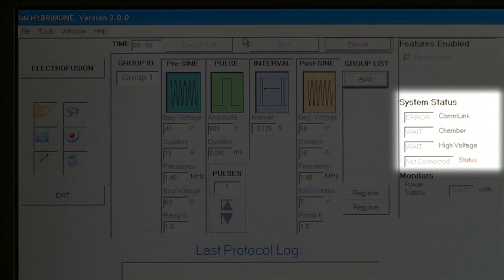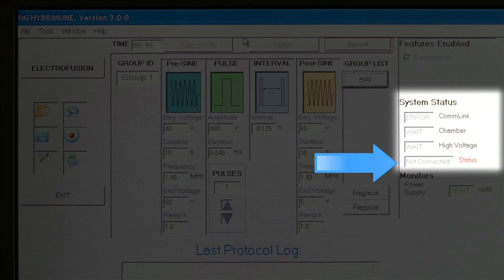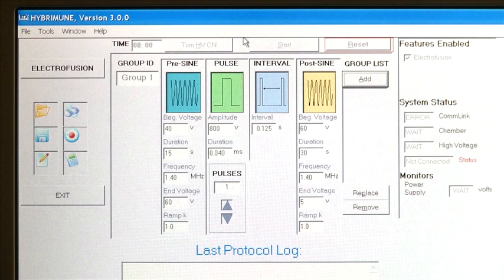When the electrofusion chamber cable is not attached to the system, the chamber window will display not connected. As a safety feature, the high voltage power supply cannot be enabled and protocols cannot be run while the system is in this state. However, protocols can be programmed and saved in this state.